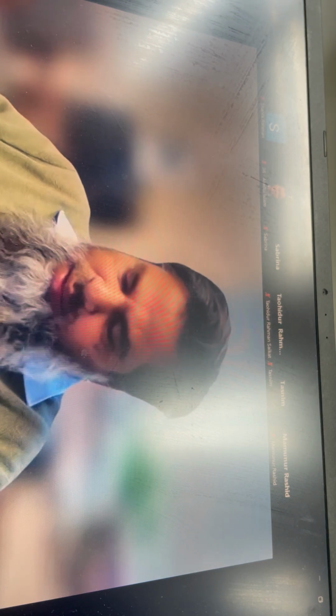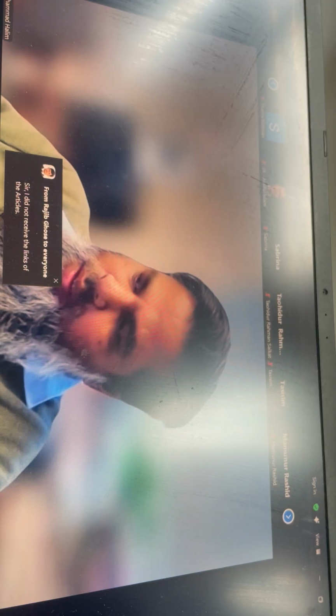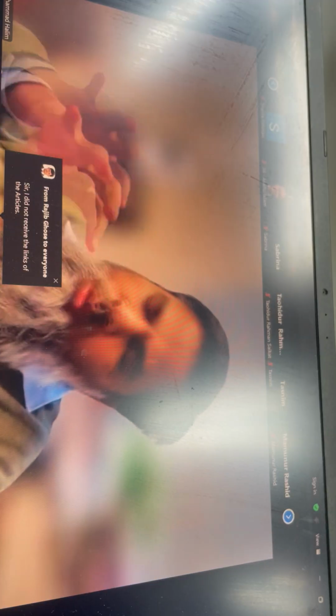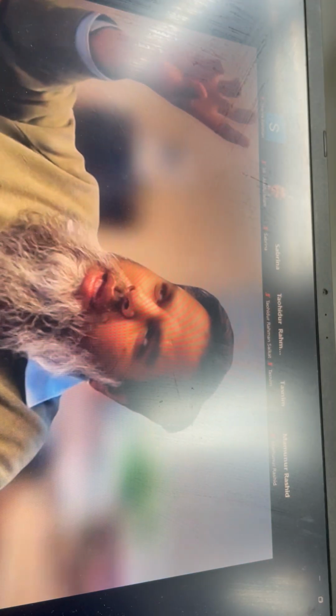Okay, so let's say you have a cancer cell and you want to know what new metabolites are produced in the cancer cell. Is that right? Then you will extract and run it through the mass spec. So then you need to do two types of analysis. One is single mass spec, meaning you are not fragmenting. And the second experiment you will also be doing fragmentation.